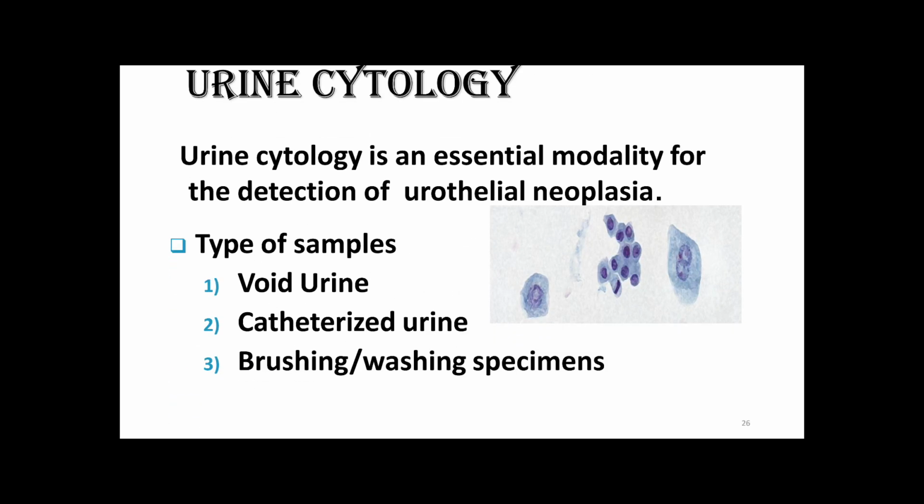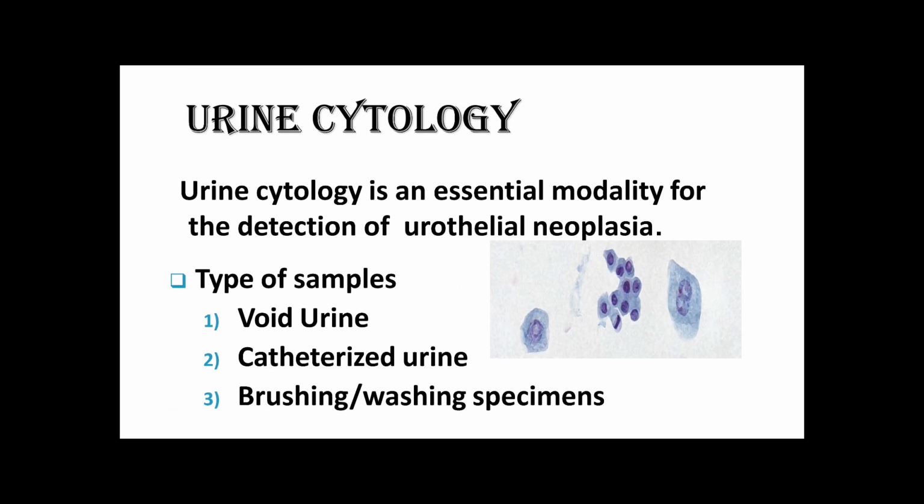So let's move. Urine cytology is useful in diagnosing diseases involving the mucosa of the urinary tract. So it is an essential modality for the detection of urothelial neoplasm.